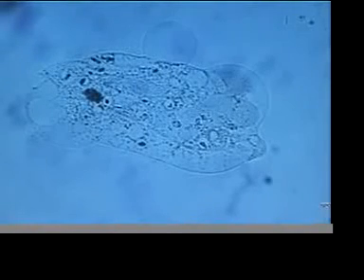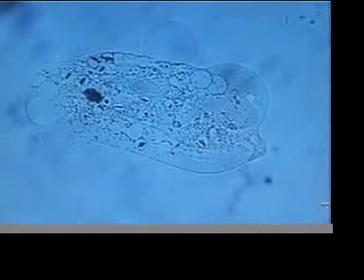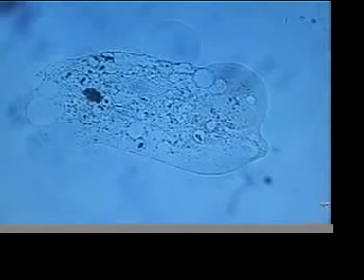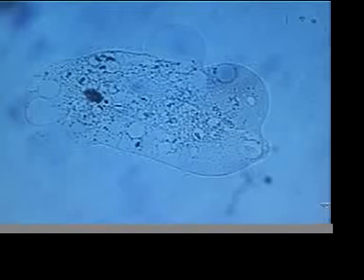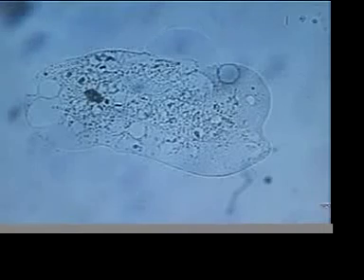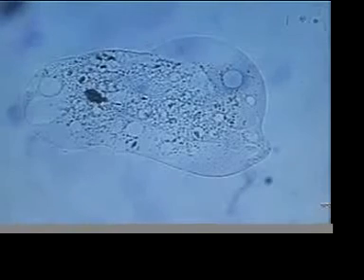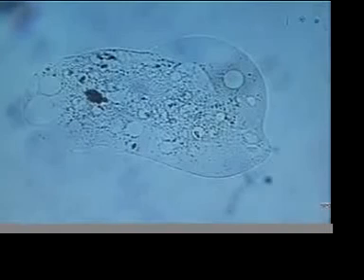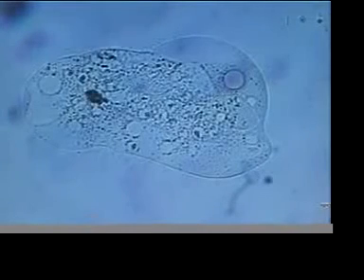We're looking at this through a microscope filter known as a DIC filter, which gives us a nice sense of contrast and surface texture. You can alter the filter live. Now, this is with the 40x objective, and I think you won't see quite as much variation. We continue to see changes in the organism. It's completely unrecognizable now. Formerly a paramecium.